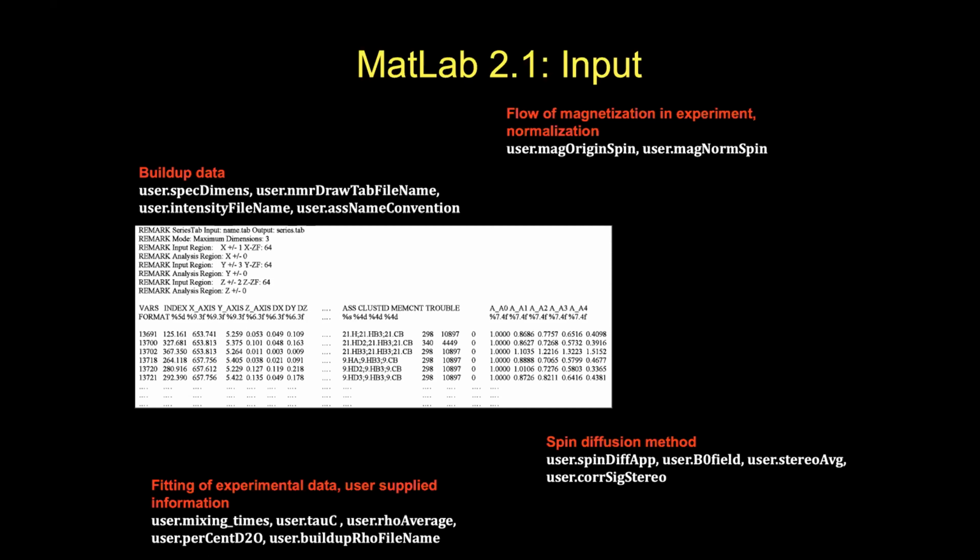Now, if you have a NOESY series, you don't want to assign all the NOESYs. You just assign them in your easiest NOESY. That's of course the one with the longest mixing time because you have the strongest peaks. And then there's a small script that is just provided in NMR pipe or NMR draw, where you can go into all the other NOESYs and it will read out the intensities at the same positions as the one you have assigned.